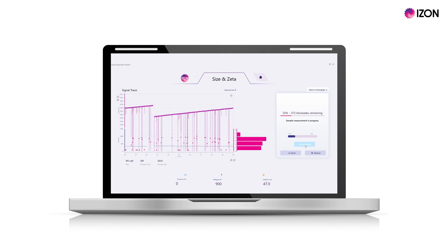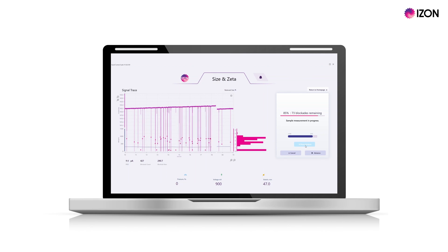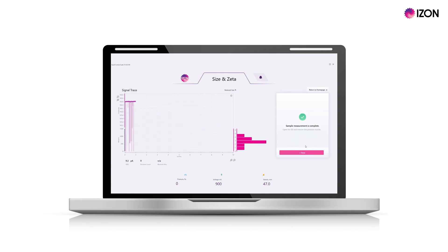The Exoid will take a single measurement of 500 blockades per sample at the highest voltage and with zero pressure applied. Once your sample measurement is complete, select done and remove the pressure nozzle.